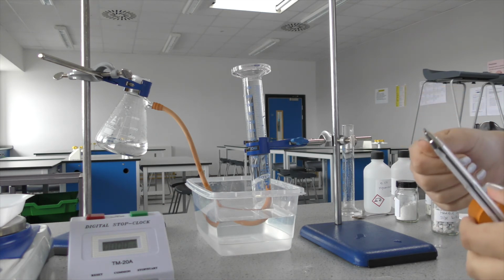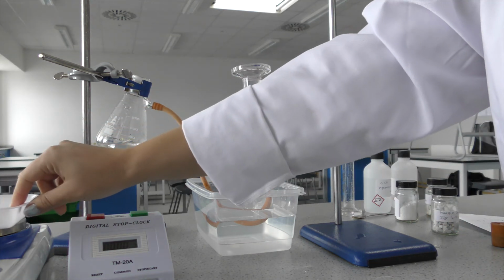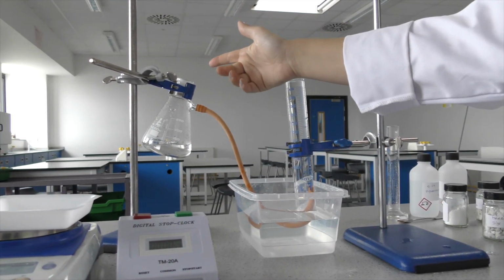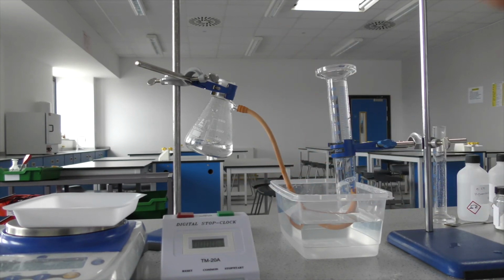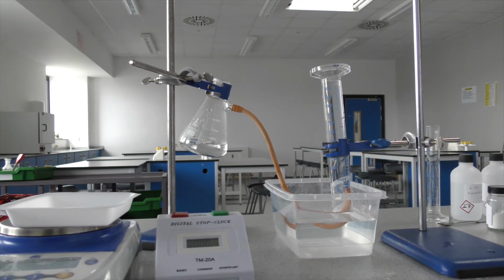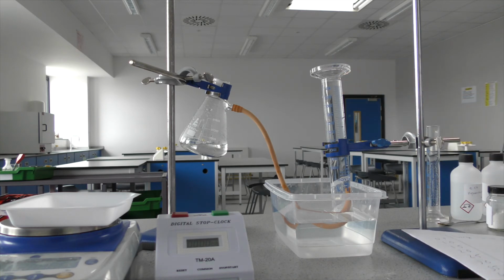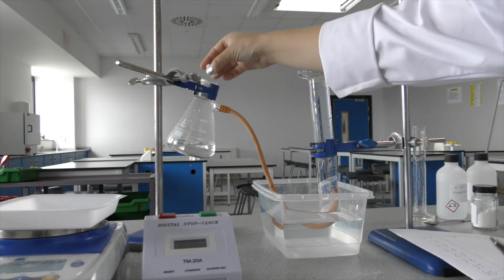The next step as well, I'm going to have to be really quick. So I'm going to add my calcium carbonate chips into my hydrochloric acid. I'm going to put the stopper on immediately and then start the clock. Every 30 seconds, I'm going to record the volume of gas that has displaced the water. So I have to be very quick with this.